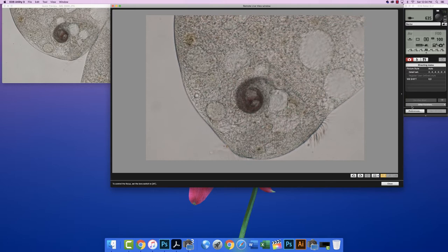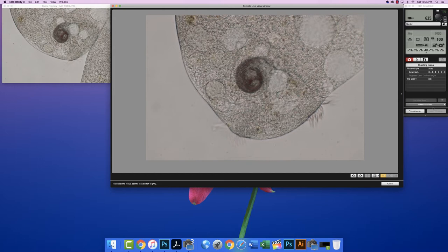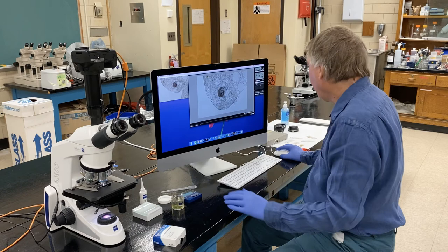I'm going to move this up a little bit. Whoops. I'm going to check my shutter to take a photograph. 1 over 15, that's too slow. So I'm going to move up the light again. Now it's all the way up, it's maxed out at 1 over 30, so that's still too slow.